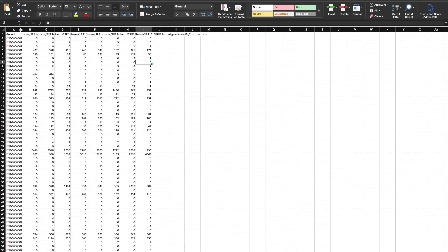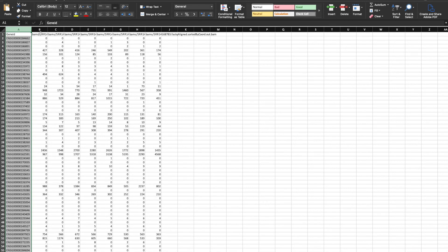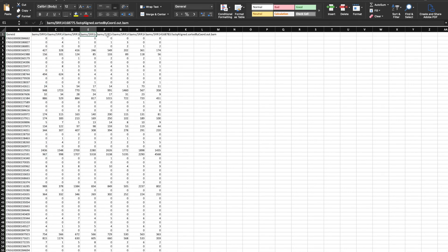So it should just be the genes. And then for each of your samples, it'll just be the name of the BAM file, or the path to the BAM file.